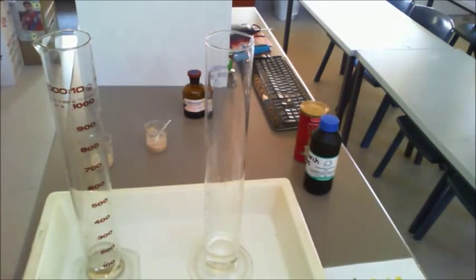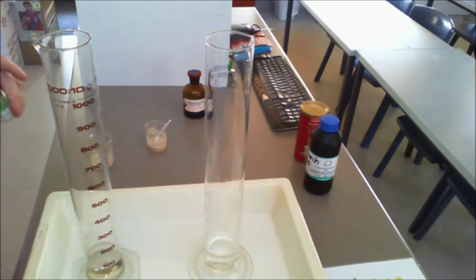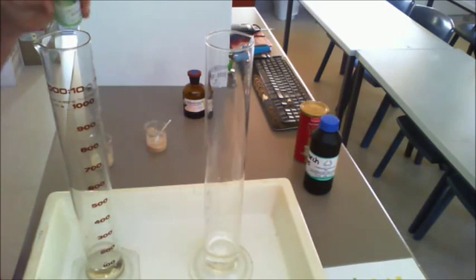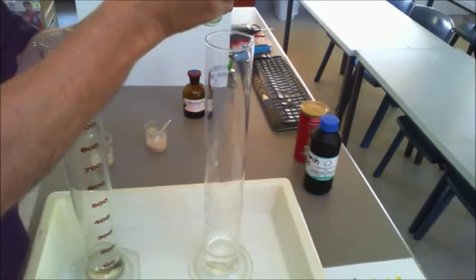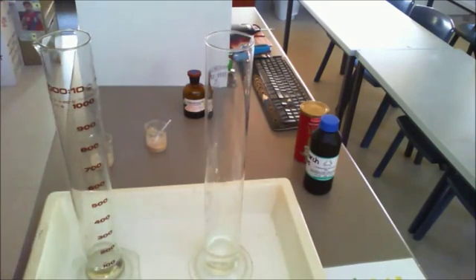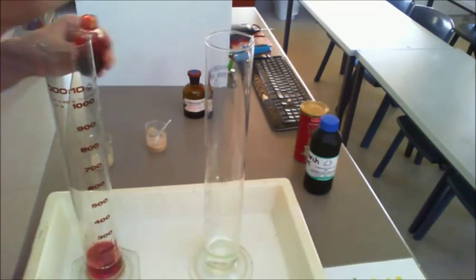We're going to add some detergent first, just some common detergent. We'll give two nice squirts of detergent into both, and that will help to produce some bubbles, so that will give us an idea of the reaction. And just to make it a little more interesting and easier to see, we'll add in some food colouring, so we'll make it nice and dark there.